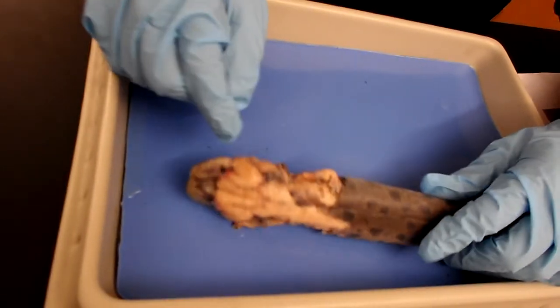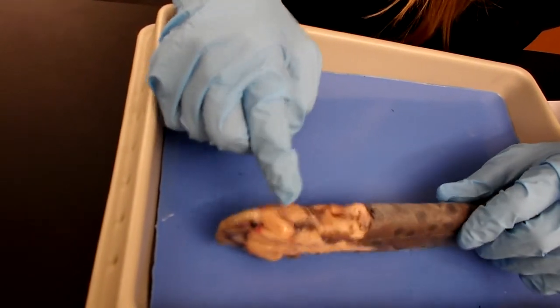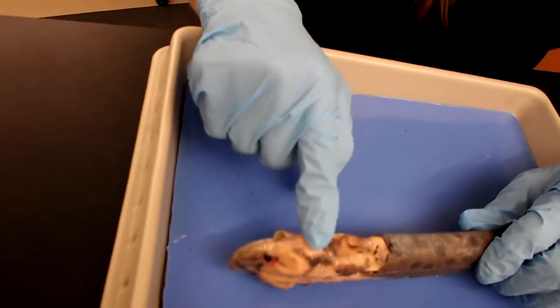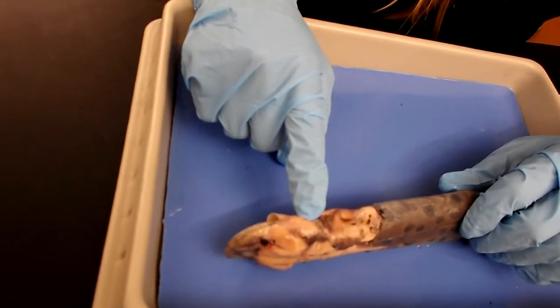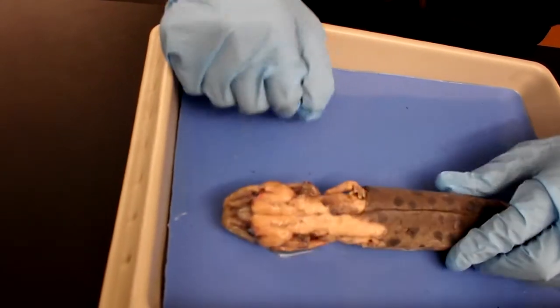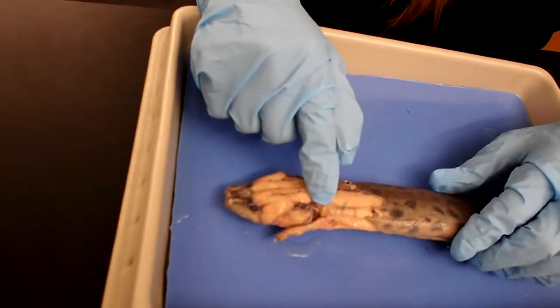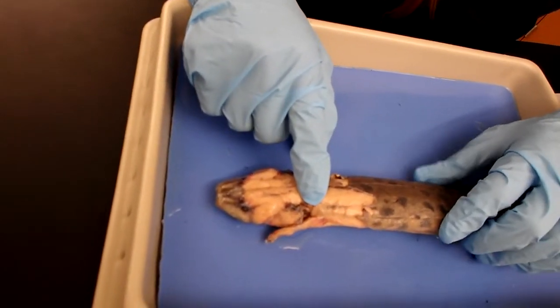The depressor mandibularis is right here. It originates at the parietal and squamosal and inserts at the angular. And right here is the branchiohyoidus, which originates at the visceral arch number 3 and inserts at the visceral arch number 2. Right here we have the levatores arcuum, and this originates at the fascia dorsalis trunci and inserts at the branchial cartilages.